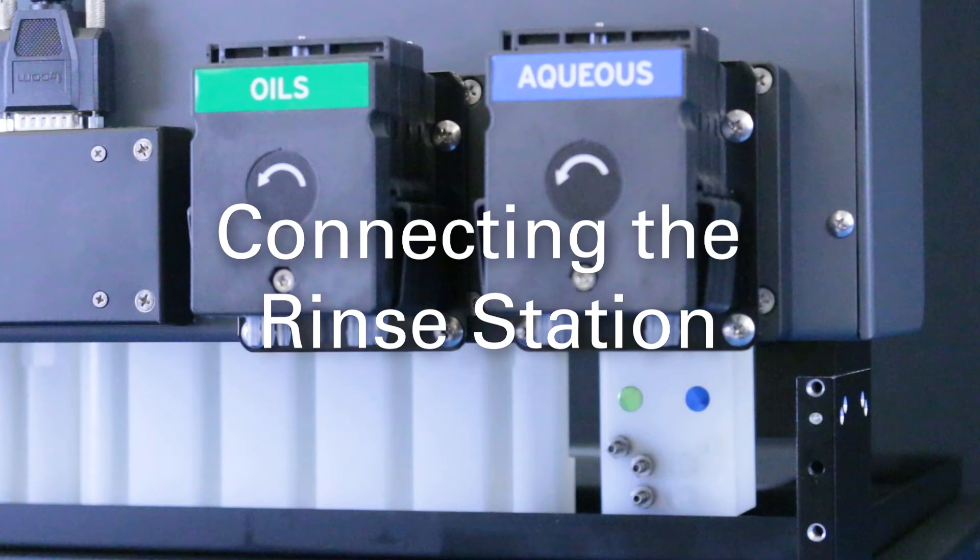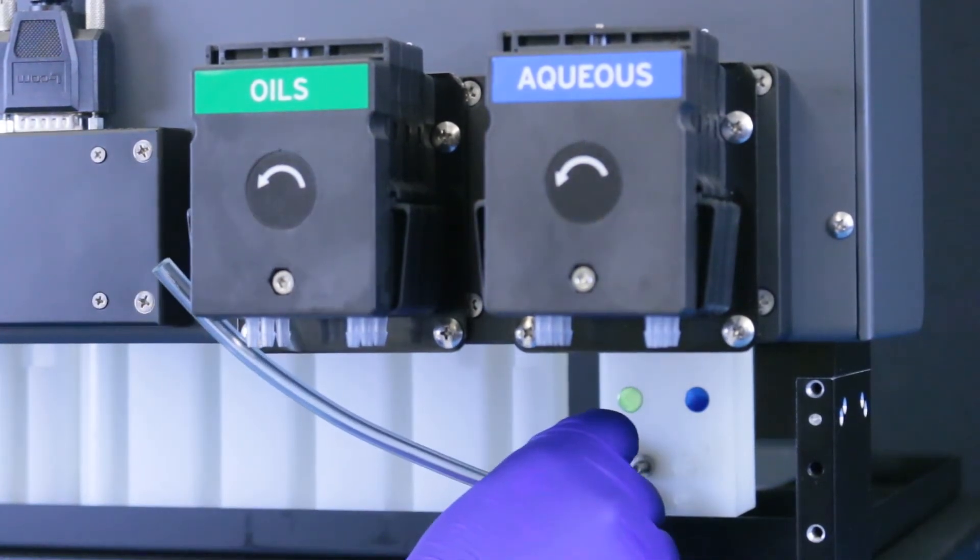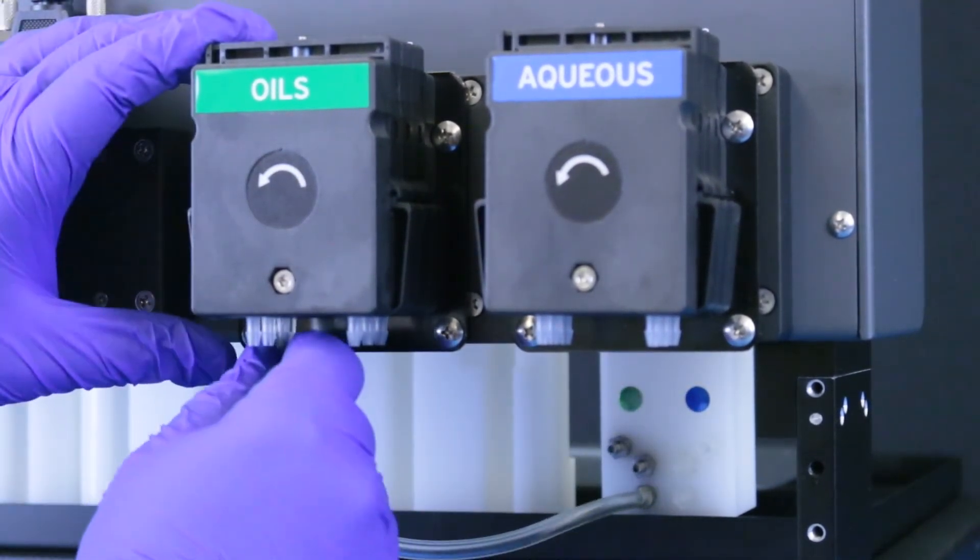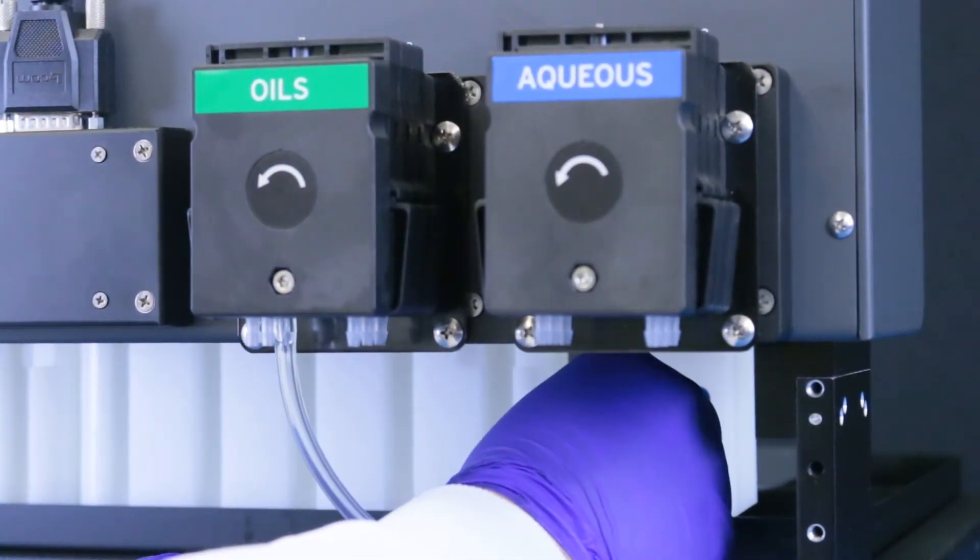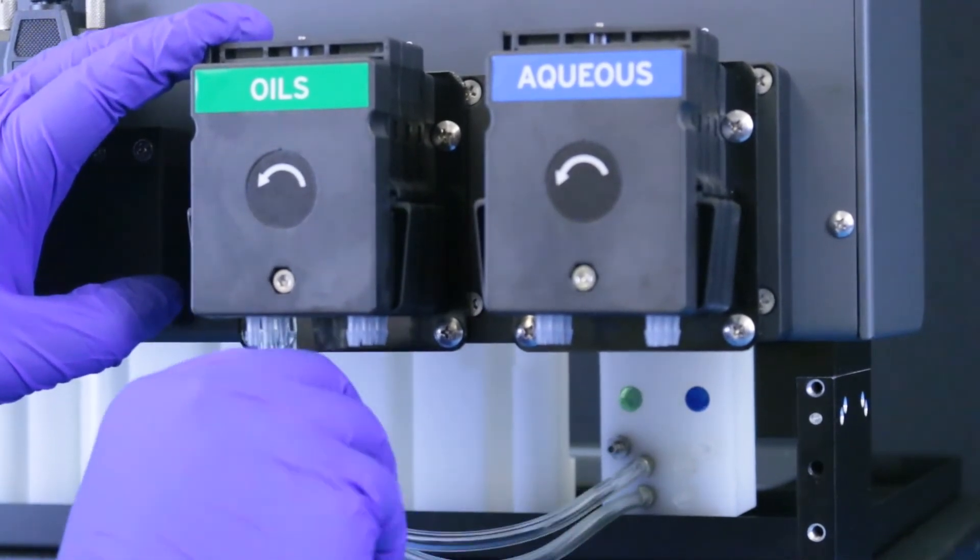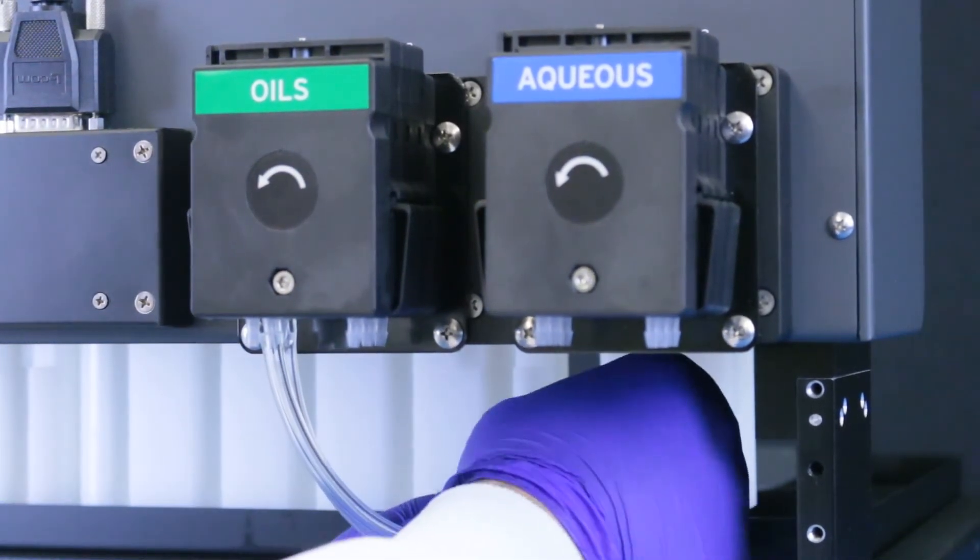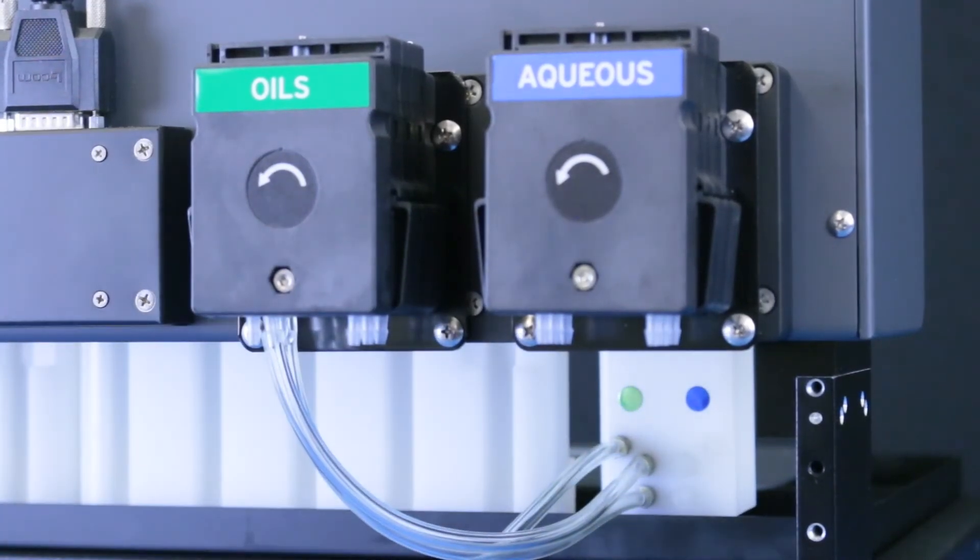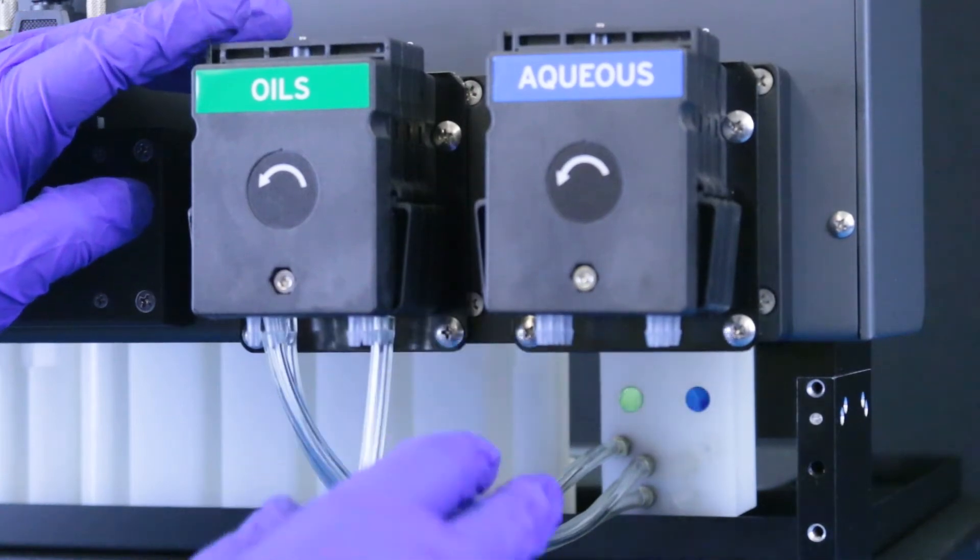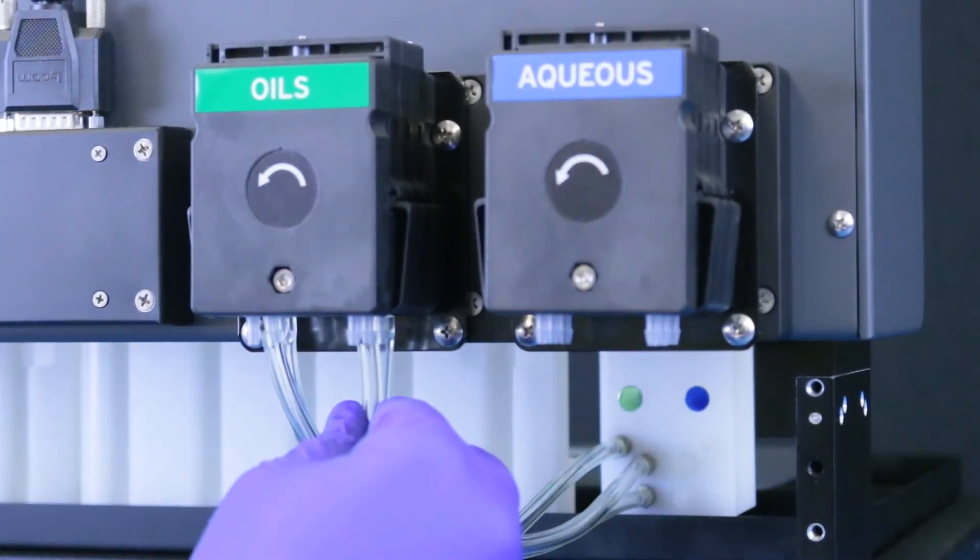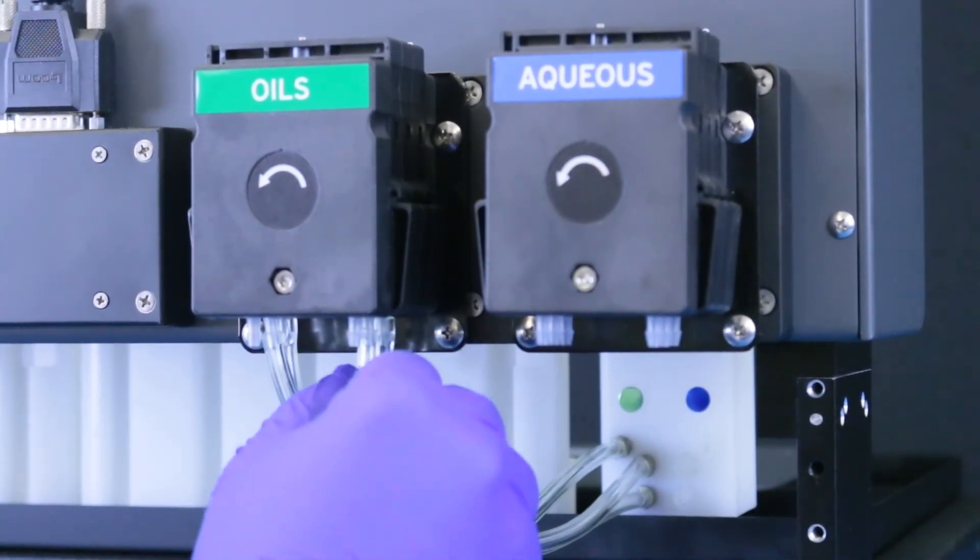Connecting the rinse station. Starting with the OILS side, cut two 25cm lengths of tubing. Connect these tubes from the left side of the pump to the two lower fittings on the rinse station. Connect a 1.8m length of tubing from the upper fitting of the rinse station to a waste container. Cut two lengths of tubing long enough to reach from the peristaltic pump to the bottom of your rinse solution container. Connect these tubes to the right inlet side of the OILS pump.